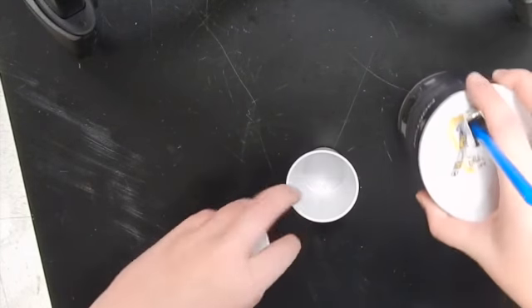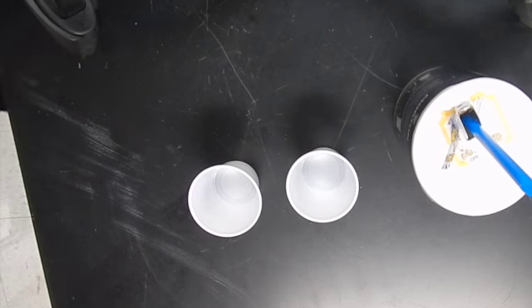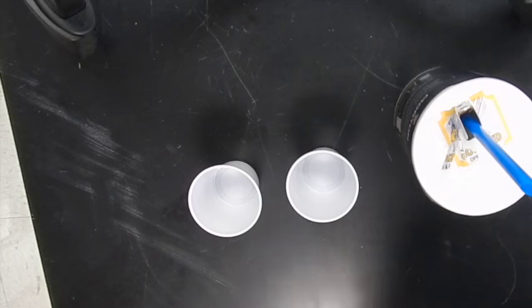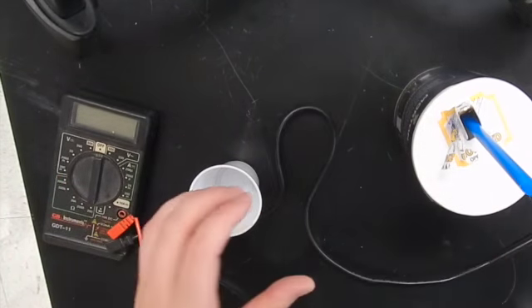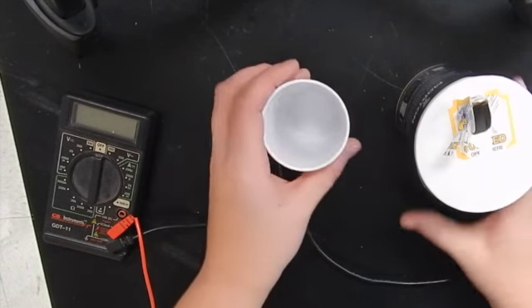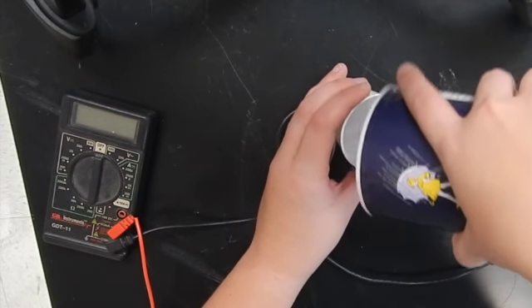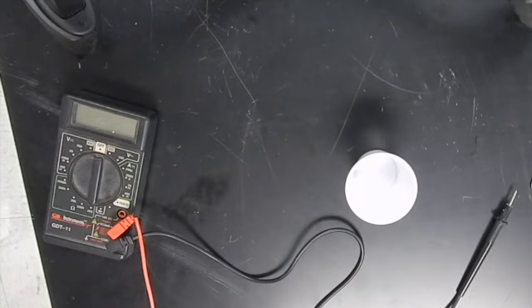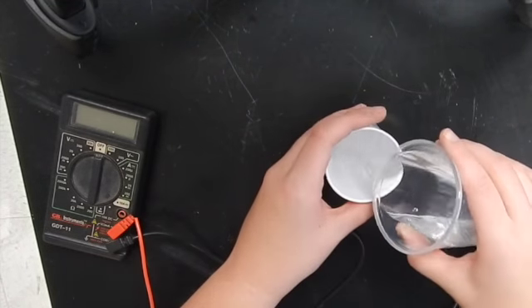Alright, so now another test to compare both salt and sugar, or covalent and ionic. We are going to look at how well it conducts electricity, or the voltage that it has. So first off, I'm going to put some sugar in this cup, or not, sorry, salt. This is salt in this cup. Mix it with a little bit of water.